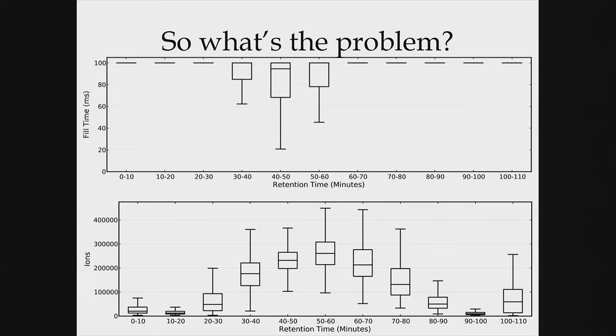You really only want to use this approach if you have a very complex sample where you absolutely need the selectivity, even at the expense of ions in the trap. The other case is on the brand new instrumentation. I've been really excited about the Lumos, because on the Lumos, the hotter ion source, due to the ion funnel and the different inlet and the better quad, actually makes it so that even with the limited sequential fills, we can still fill the Orbitrap. So that's been pretty exciting, I think.